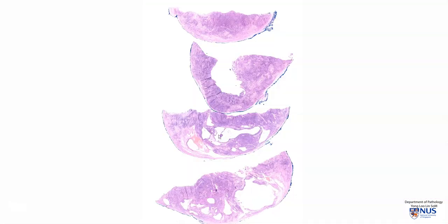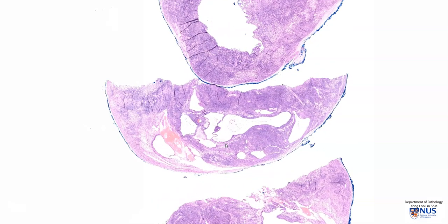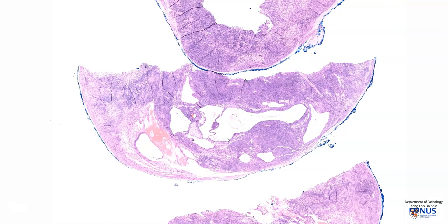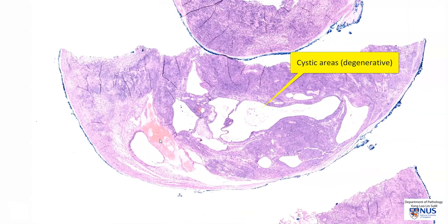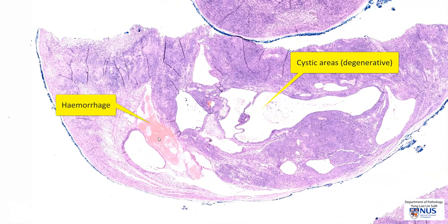These are further sections taken from the same tumor. What we can see here are these large, empty cystic spaces, and this reddish area, which is hemorrhage. Cystic change and hemorrhage can sometimes occur in schwannomas, especially the larger tumors.